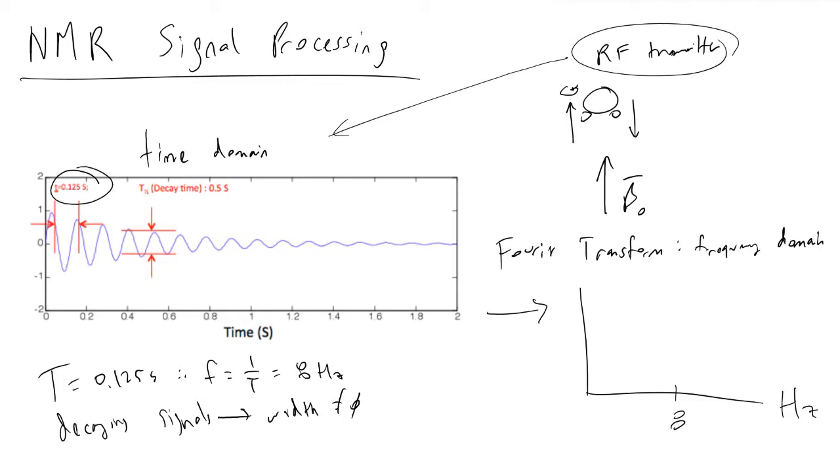And one of the ways we can determine what noise is in our NMR spectra is the noise, such as a 60 hertz wall outlet, which will appear in our raw data commonly, is stuff that is constant for all time. And because it's a constant, its decay time is technically infinity, and it appears as kind of a Dirac delta function in our Fourier transforms.